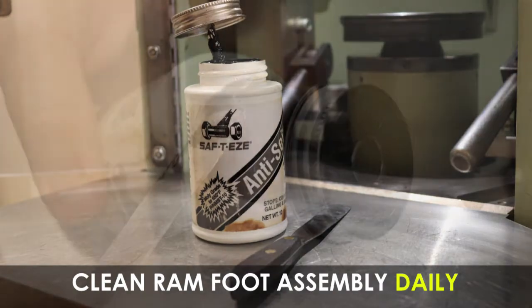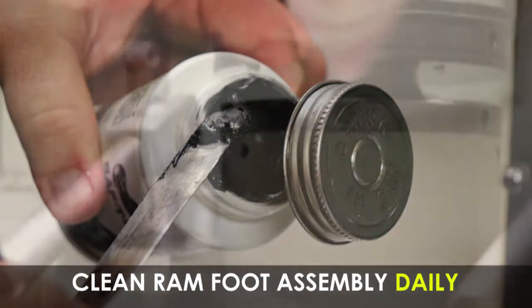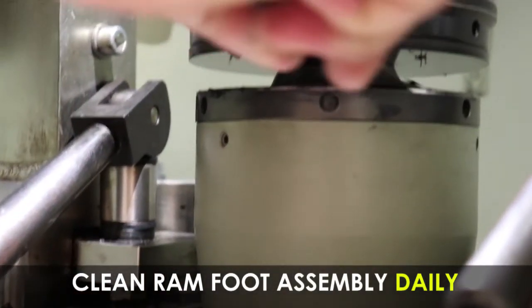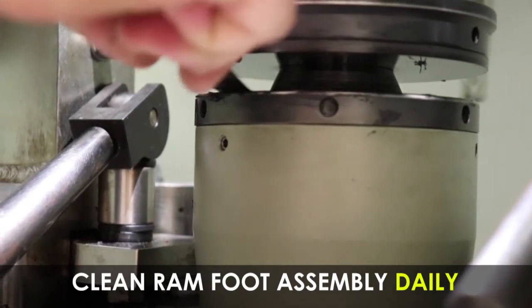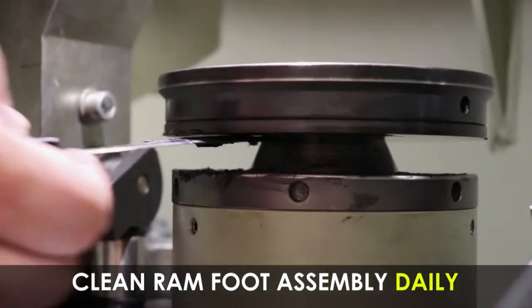With a putty knife, apply a light coat of anti-seize to the front half of the RAM body upper surface as well as the front half of the RAM floating foot lower surface.